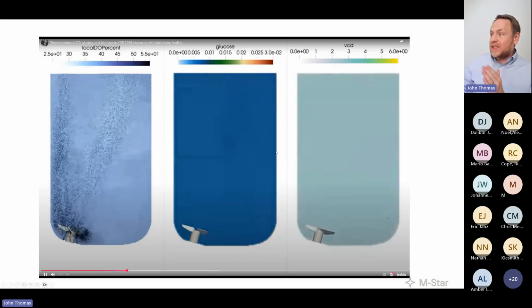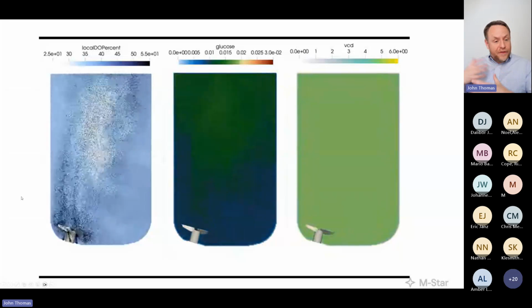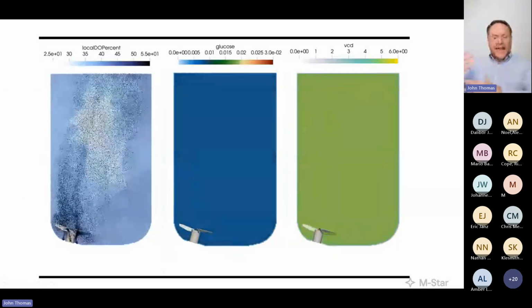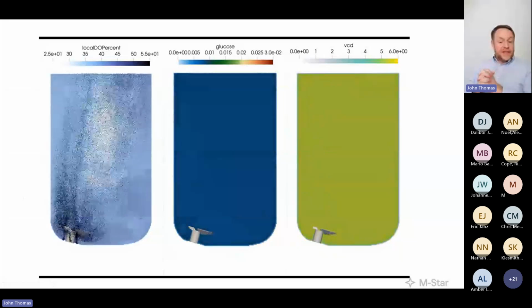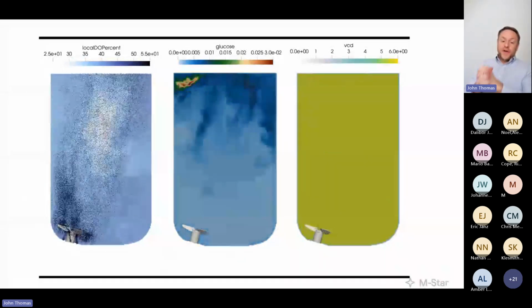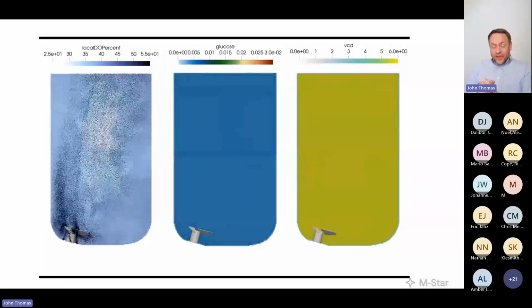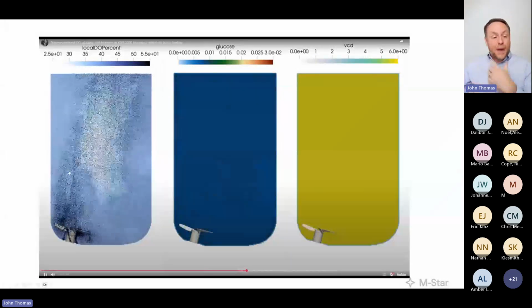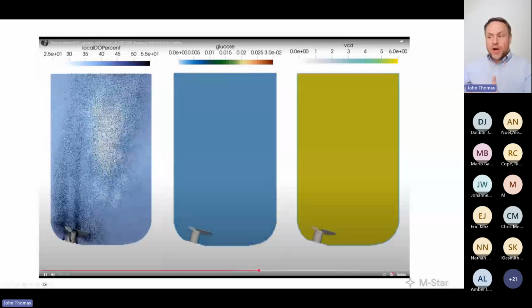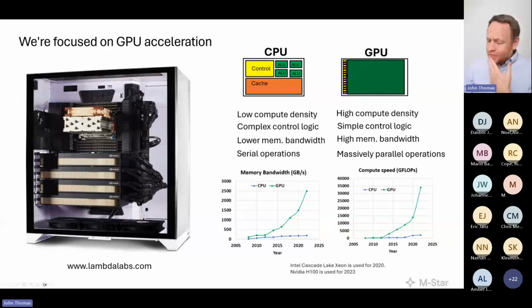We may not get all the way to these cellular mechanics today, but we'll definitely do the multi-phase flow, blending, oxygen transfer, KLA, oxygen dead zones, all of that multi-phase physics today, inclusive of metabolism to include O2 consumption and CO2 production, all within the context of the time-accurate three-dimensional flow simulations. So our goal today is bioreactors, process simulation, and best practices within the context of these multi-phase simulations.